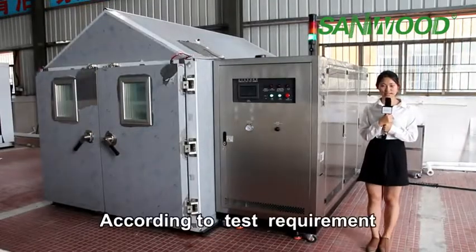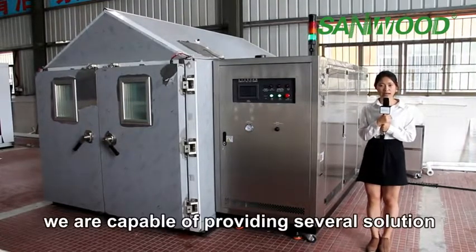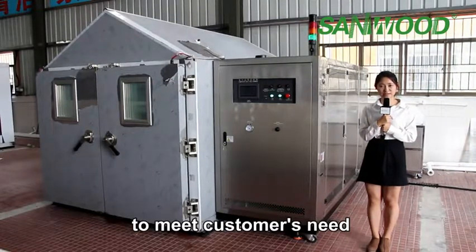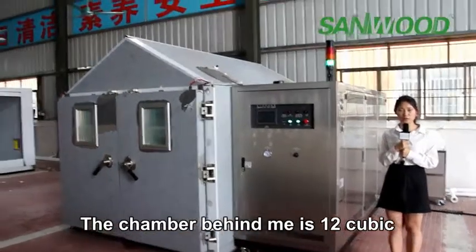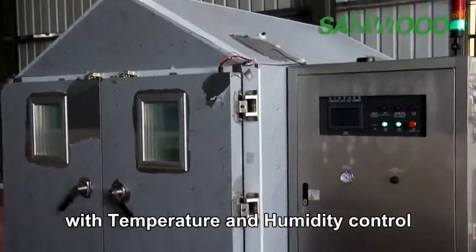According to test requirements, size of test specimens and installation site, we are capable of providing several solutions to meet customers' needs. The chamber behind me is a 12 cubic walk-in cyclic corrosion test chamber with temperature and humidity control.